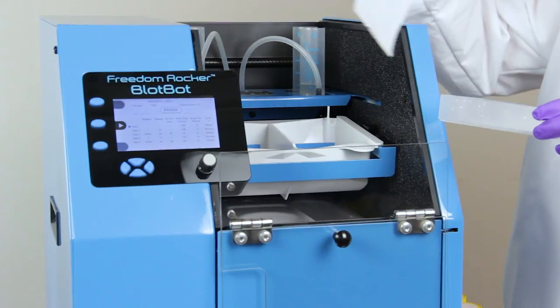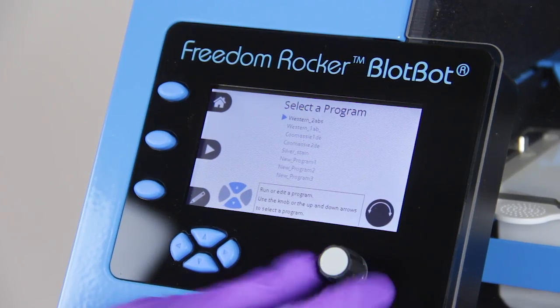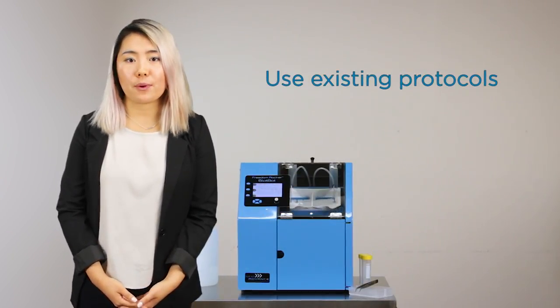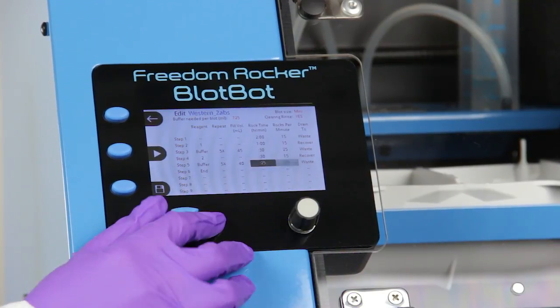Just add your gels or blots to the trays, add your reagents to the reservoirs, select your protocol, and walk away. There's no need to change your existing protocols, and it's incredibly easy to edit a program to run your existing protocol.